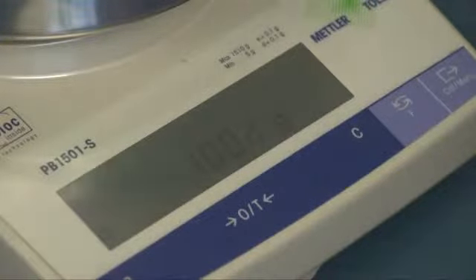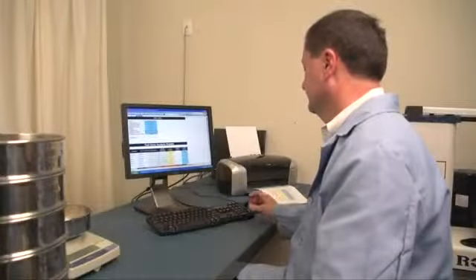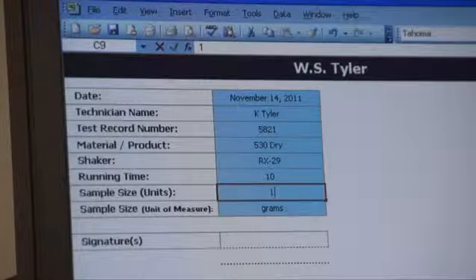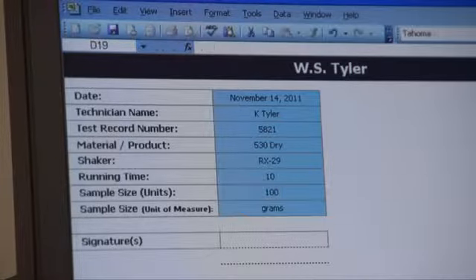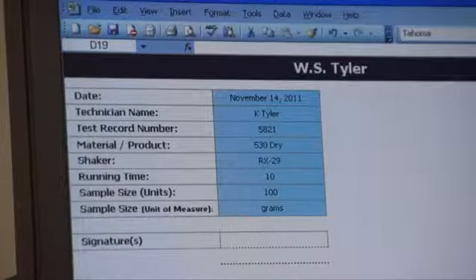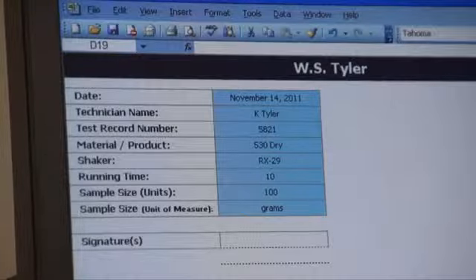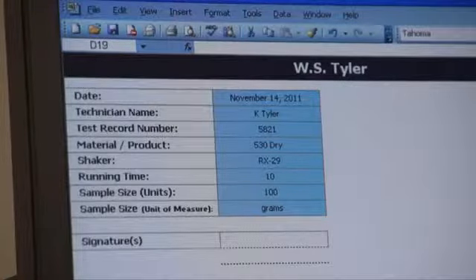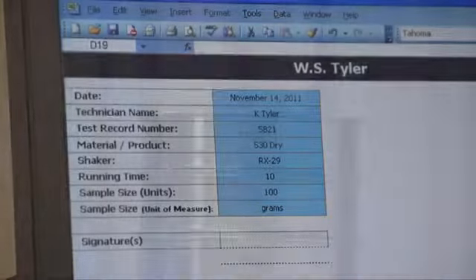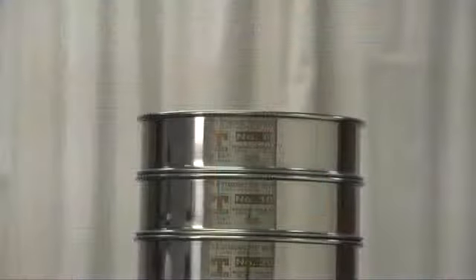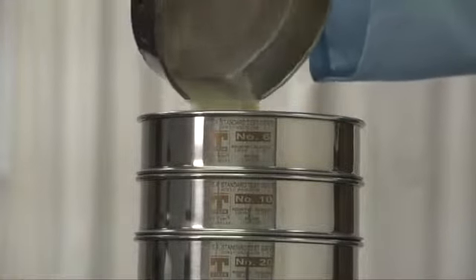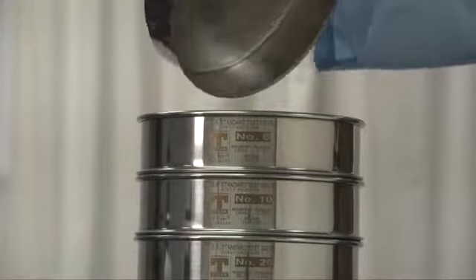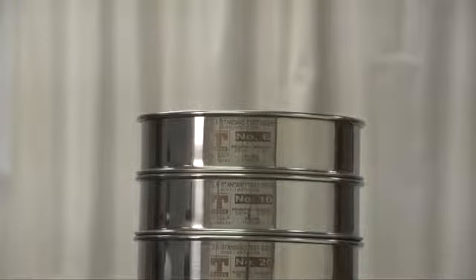Weigh the entire sample and record the weight. W.S. Tyler offers sieving software for basic spreadsheet analysis. Additional test information includes company name, test number, and date. This may be saved and used as a permanent printed record. Empty the entire sample into the top sieve of the stack. Make sure that you do not overload any sieve as this may cause blinding.